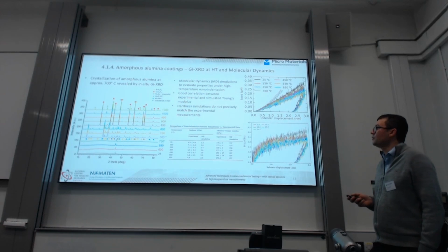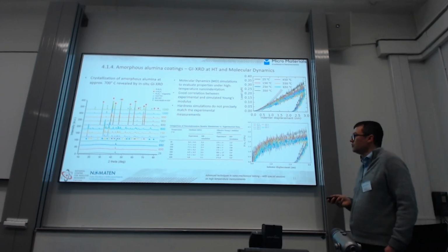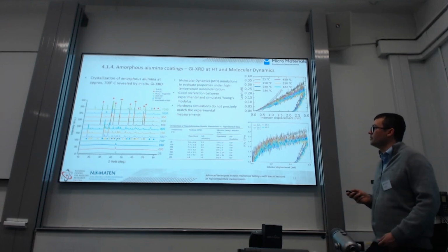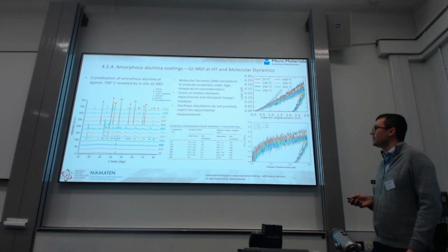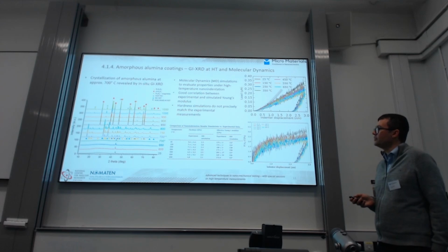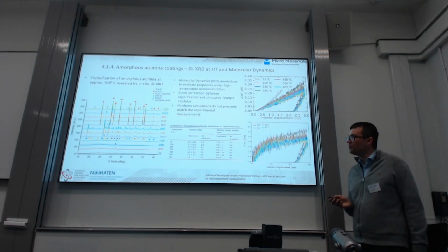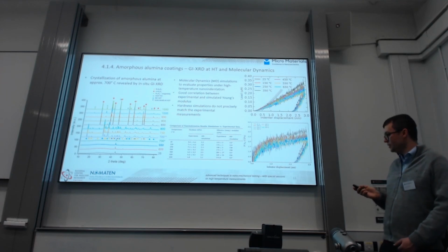And here the simulation group performed some molecular dynamics simulation to compare the simulated result of nanoindentation with the experimental one. And we see that for Young's modulus, the simulated results quite match the experiment, but for nanoindentation hardness, the differences are quite big. So I think we should work more on our models of nanoindentation by molecular dynamics.